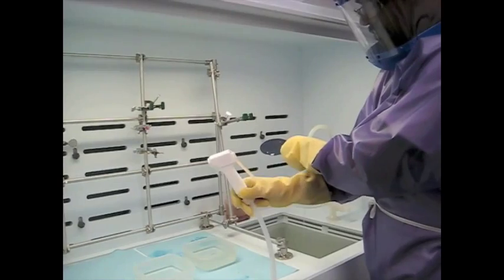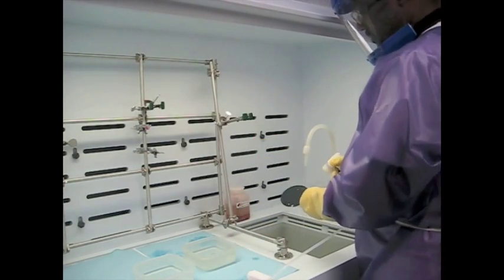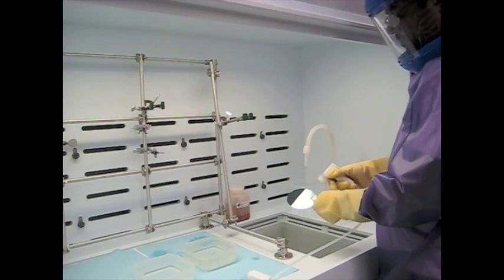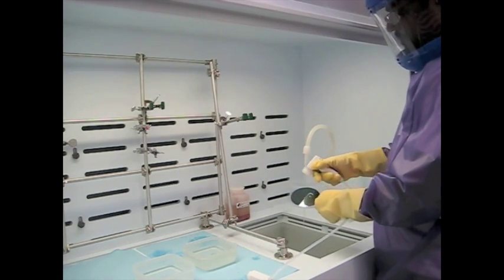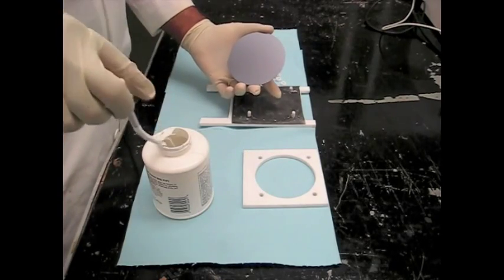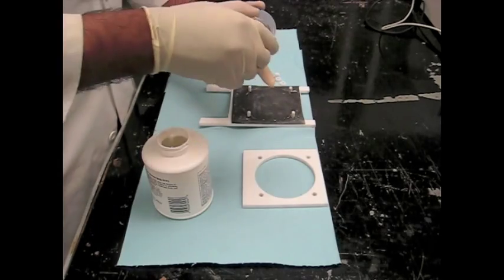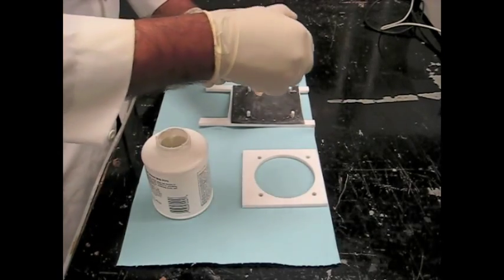The next step is to permanently transfer the microchannel patterns into the silicon wafer. This is achieved using a potassium hydroxide etchant. A Teflon coating is applied to the non-device side of the silicon wafer in order to prevent backside etching of the wafer when placed in the KOH etchant.